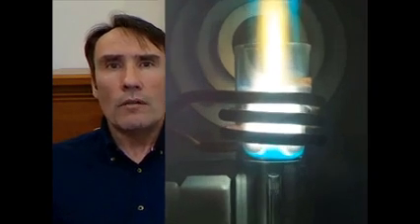Now, the plasma is an argon gas cloud, so it's made up of argon ions and electrons. And it's held in a nice tight fireball, you could call it. It's held in this fireball by the use of an RF current going through an RF load coil. And this holds the argon plasma into this nice tight fireball.